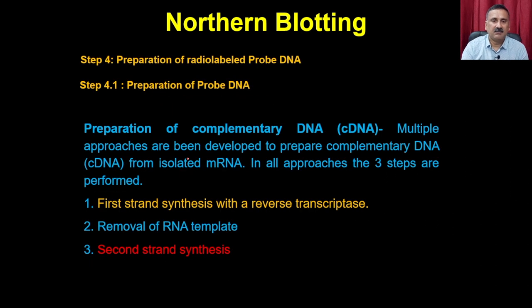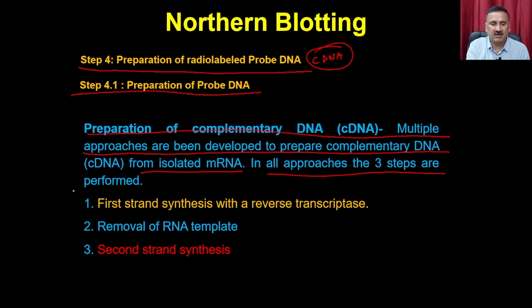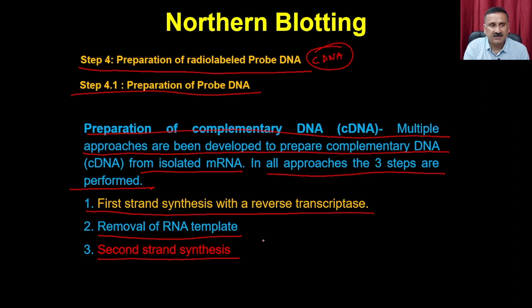The next step is preparation of the radiolabeled probe, radiolabeled cDNA probe, right. So, preparation of probe DNA. For preparation of the complementary DNA or cDNA, multiple approaches have been developed to prepare complementary DNA from the isolated messenger RNA. In all approaches, 3 steps are performed. You are going to have the first strand synthesis with the help of a reverse transcriptase, then the removal of the RNA template, and then the synthesis of the second strand.